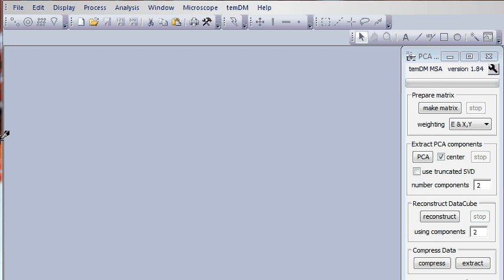First, people seldom need more than 10-20 components. Thus, the possibility to evaluate quickly the most major components is very useful. Second, sometimes one indeed needs to explore many components, for instance, to investigate how noise behaves over the large scale. For that case, the SVD is useful.